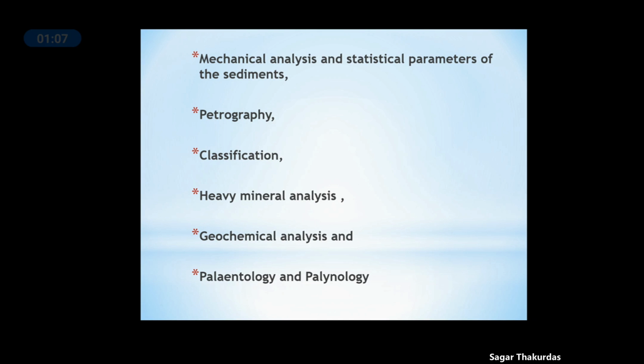Then based on these studies we can do the classification of these rocks, whether it is a sandstone, limestone, and what kind of limestone it is or what type of sandstone it is. There are various classifications given by different scientists, so the best suited classification scheme can be applied and the sediments can be grouped into different classes.